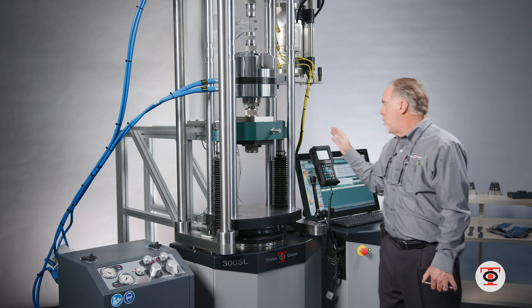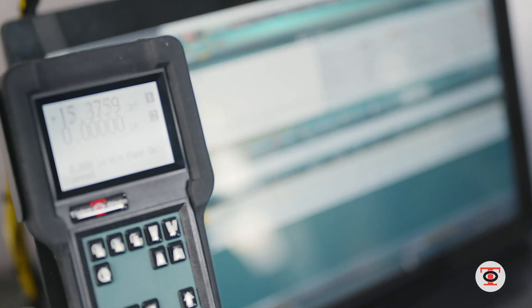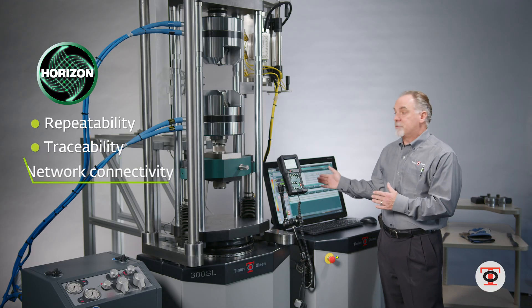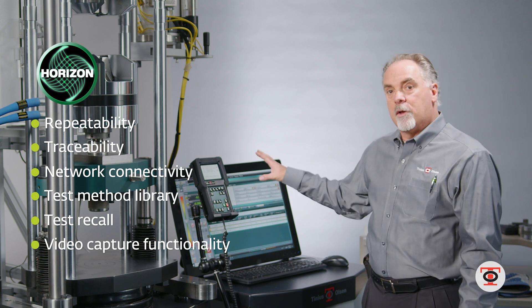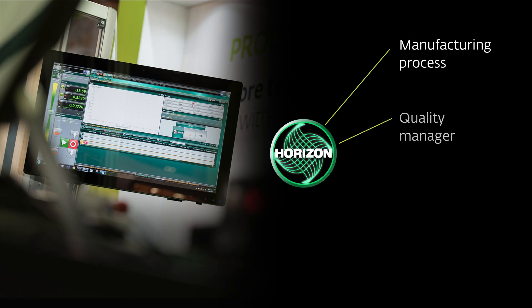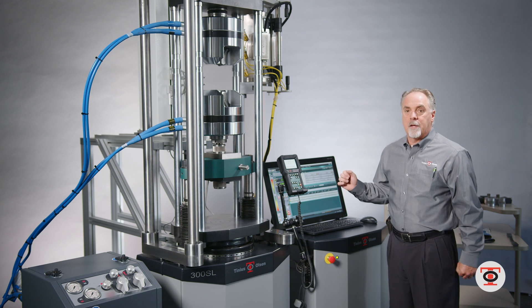The machines come with Horizon software. The software gives you the ability to get repeatable results, with the machine calibrated to tight standards whether it's ASTM or ISO. Ease of use with different operators — different operators can log in as themselves and you have traceability to track any changes they make in the software. You also have network connectivity where this can reside on a company network so anybody with the privileges can log in, read the data or test results, pull the data, and format it in Excel or print a PDF of the graph.